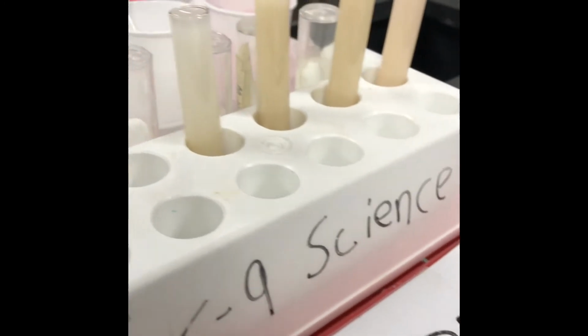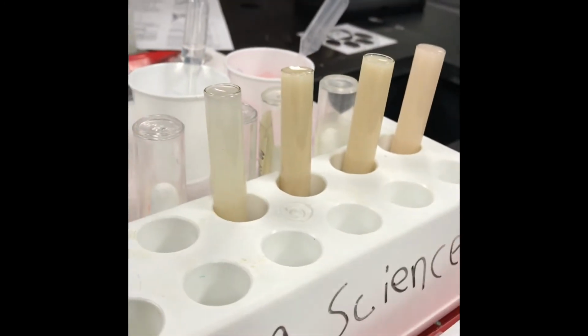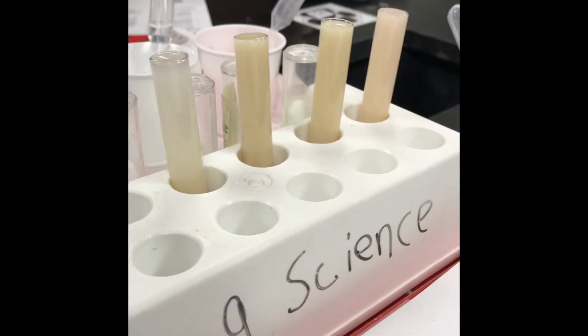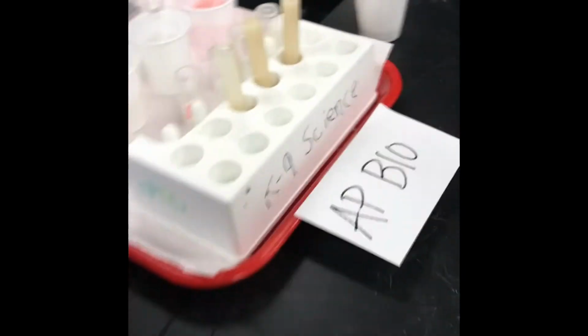One of these has distilled water. Is it probably this one? Yes. Okay, and then they have glucose in one, fructose in one, and sucrose in one. And now they're going to take these vials right here, and they're going to cap them off to cut off the oxygen supply.